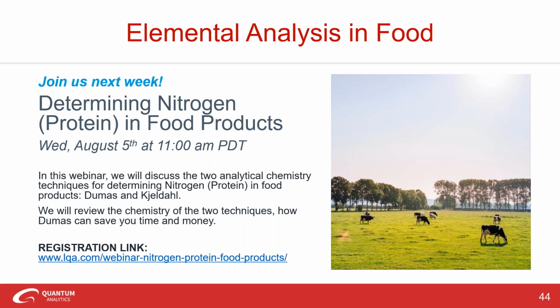Okay, so XRF generally is used for solid samples, and it's not very suitable for the assessment of dissolved components in aqueous samples. Sometimes pre-concentration can be used, like using a polycarbonate membrane, but generally other trace analysis techniques like atomic absorption spectroscopy or ICP will generally perform better than an XRF can do. However, XRF is great for analyzing some of the suspended fractions in an aqueous sample. So you still can measure that, but there are limits.